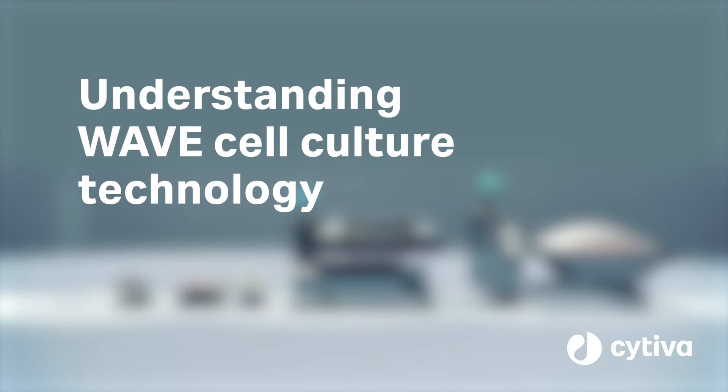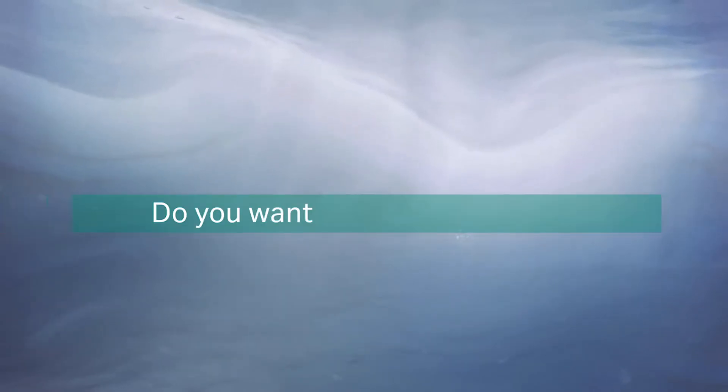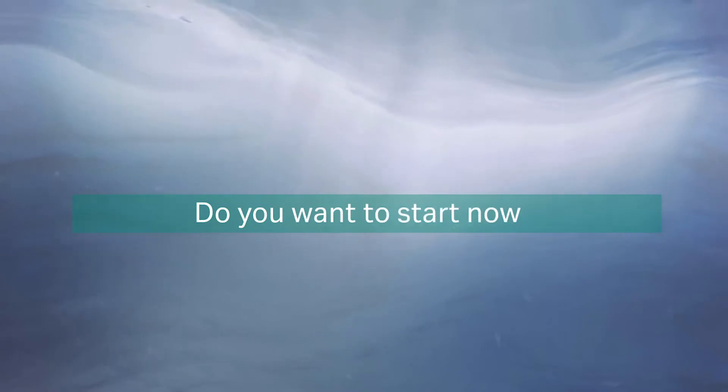Cytiva, the pioneers of the disposable bioreactor used in research and GMP manufacturing for over a decade. Do you want simple, effective cell culture? Do you want proven technology? Do you want to start now?